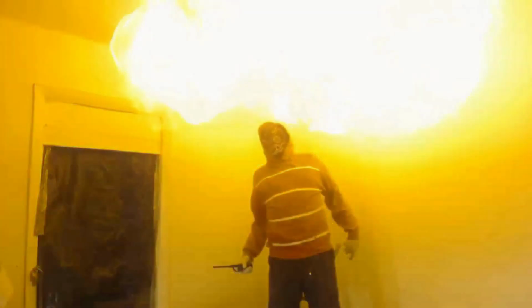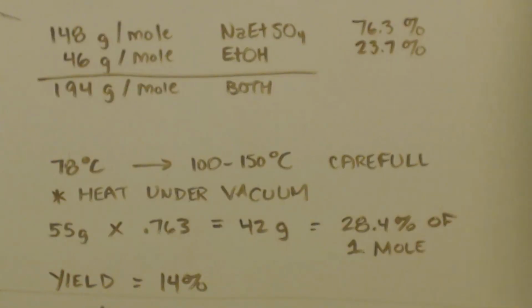This is not an instructional video. It is just a vlog showing a video account of some chemistry experiments I have done or am learning about. I do not go over all safety concerns, so if you repeat anything in the video, you do it at your own risk. So this is part 5 and the final part of sodium ethyl sulfate synthesis.